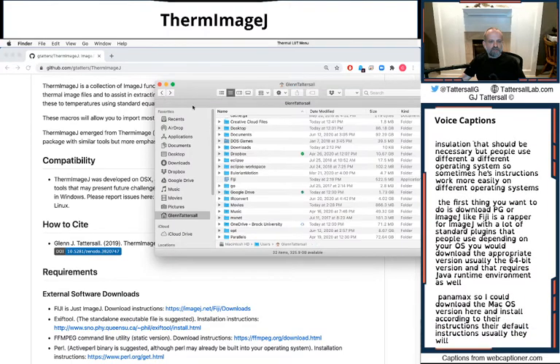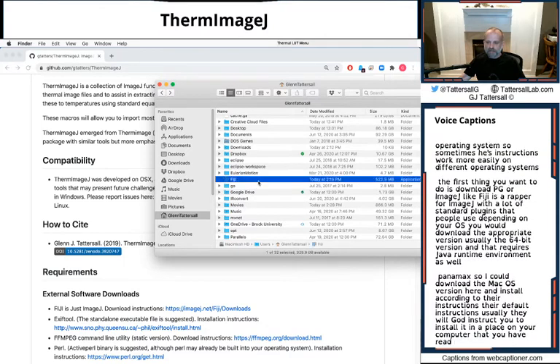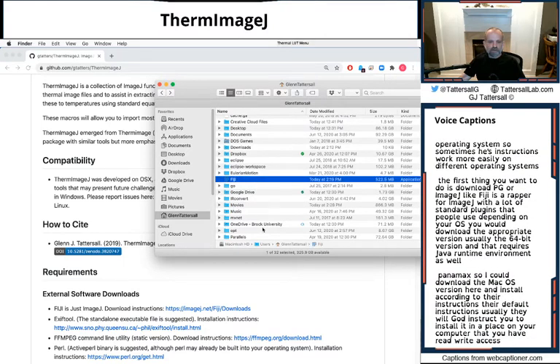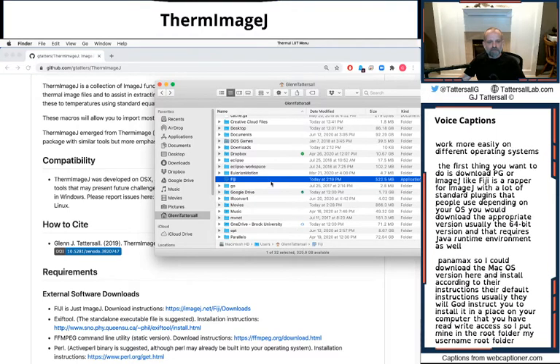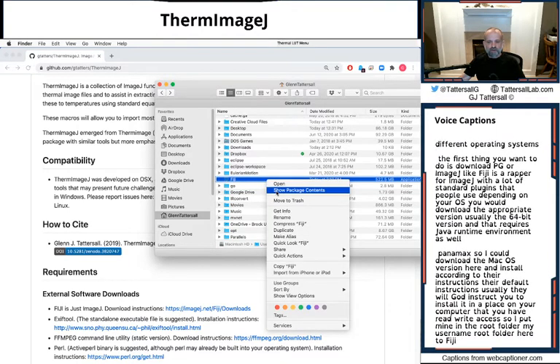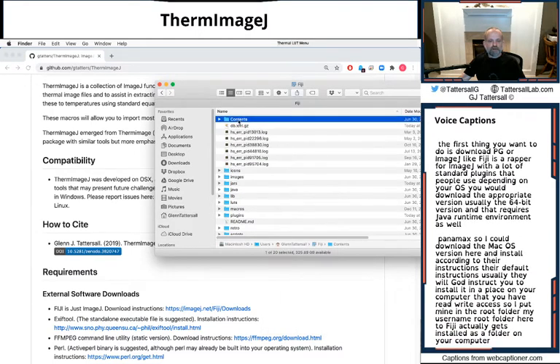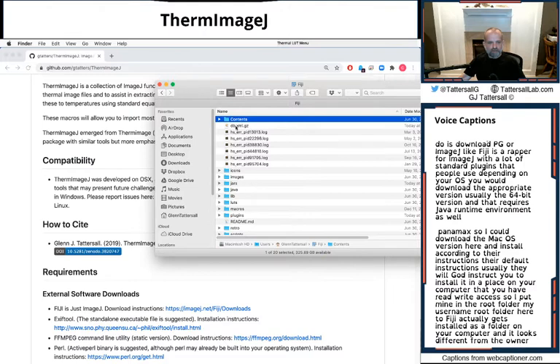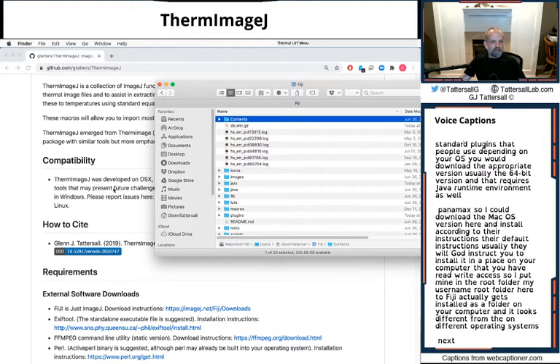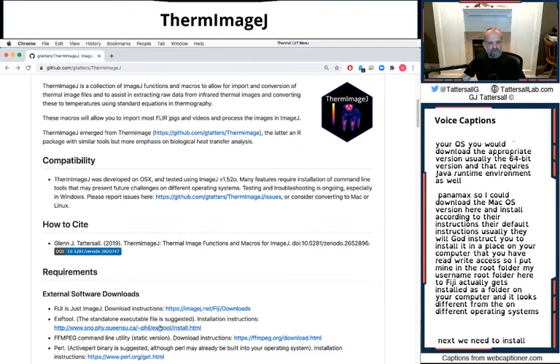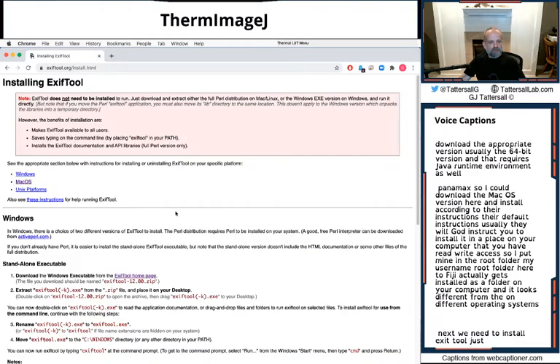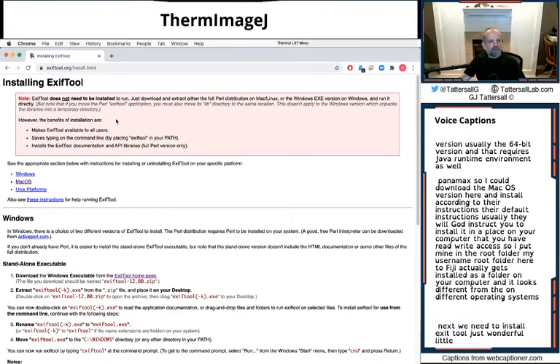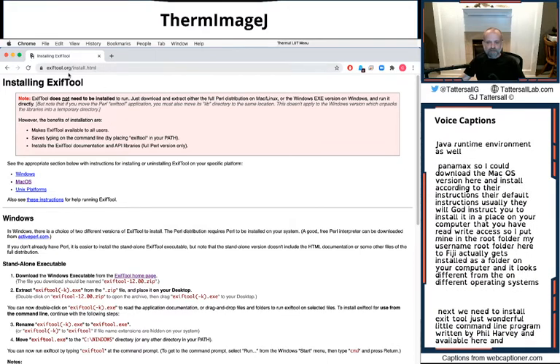They instruct you to install it in a place on your computer that you have read-write access. So I put mine in the root folder, my username root folder here. Fiji actually gets installed as a folder on your computer and it looks different from different operating systems. Next we need to install EXIFTOOL. This wonderful little command-line program written by Phil Harvey and available here on this site.